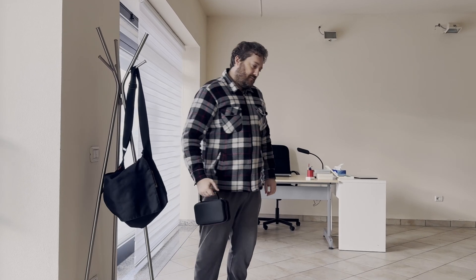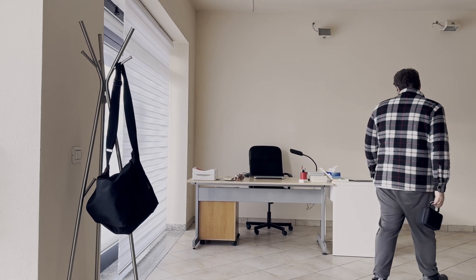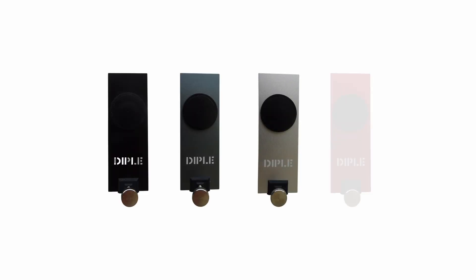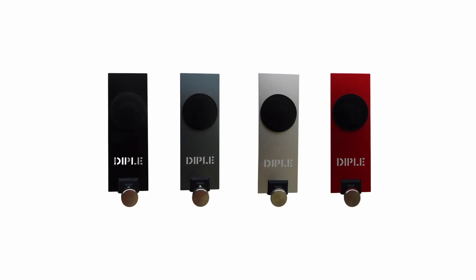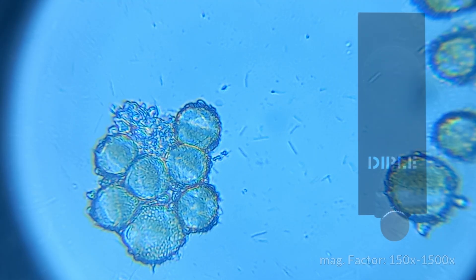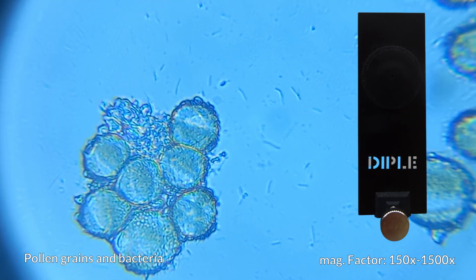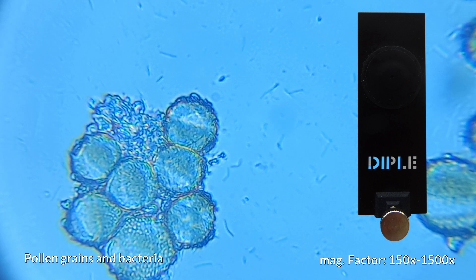You can take Dipple 2 with you in your backpack, or just in its carrying bag, and you can put it directly in your drawer. Four different lenses suitable for different uses, all of them with a polarizing filter inside. Black lens: with optical resolution of 0.7 micrometer, you can see cellular details or even bacteria.